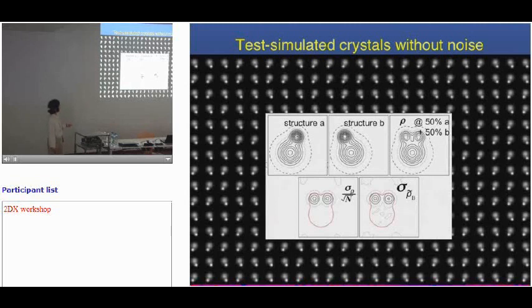Just randomly put that into a 200 by 200 lattice, and then pretending that's a crystal that I got from the microscope, I can calculate the projection map out of it. Doing the same thing, go to Fourier space, get amplitudes and phases. Then if I know how to do that, I can redo this process again every time I randomly draw my new crystal.